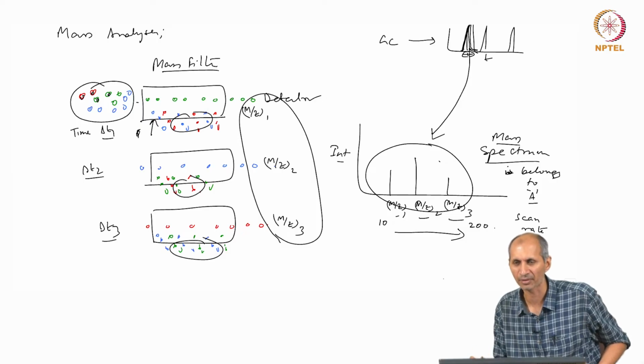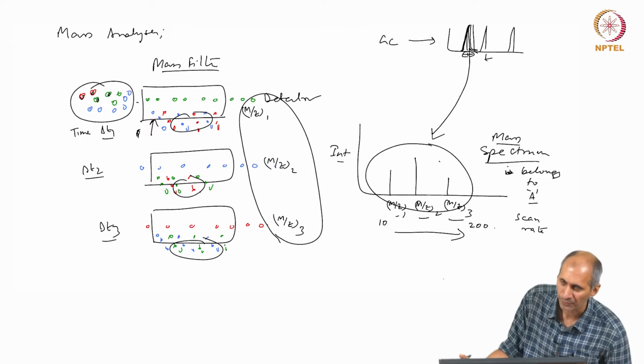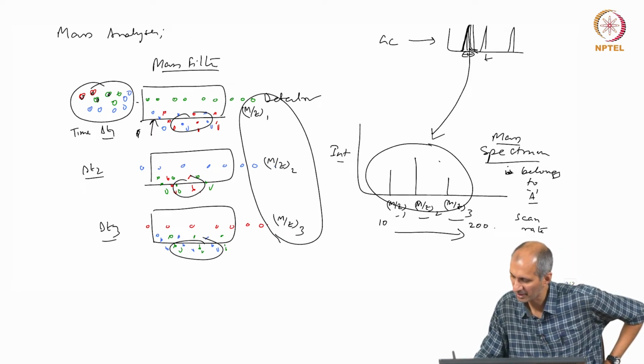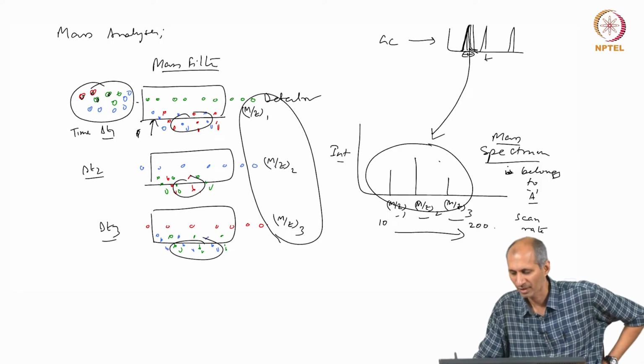You have got a lot of data now. This data is a spectrum. So, spectral information is like a signature. How do you know that this signature belongs to a compound? Wavelength? There is no wavelength here. You are talking about a different spectrum, we will come to that.